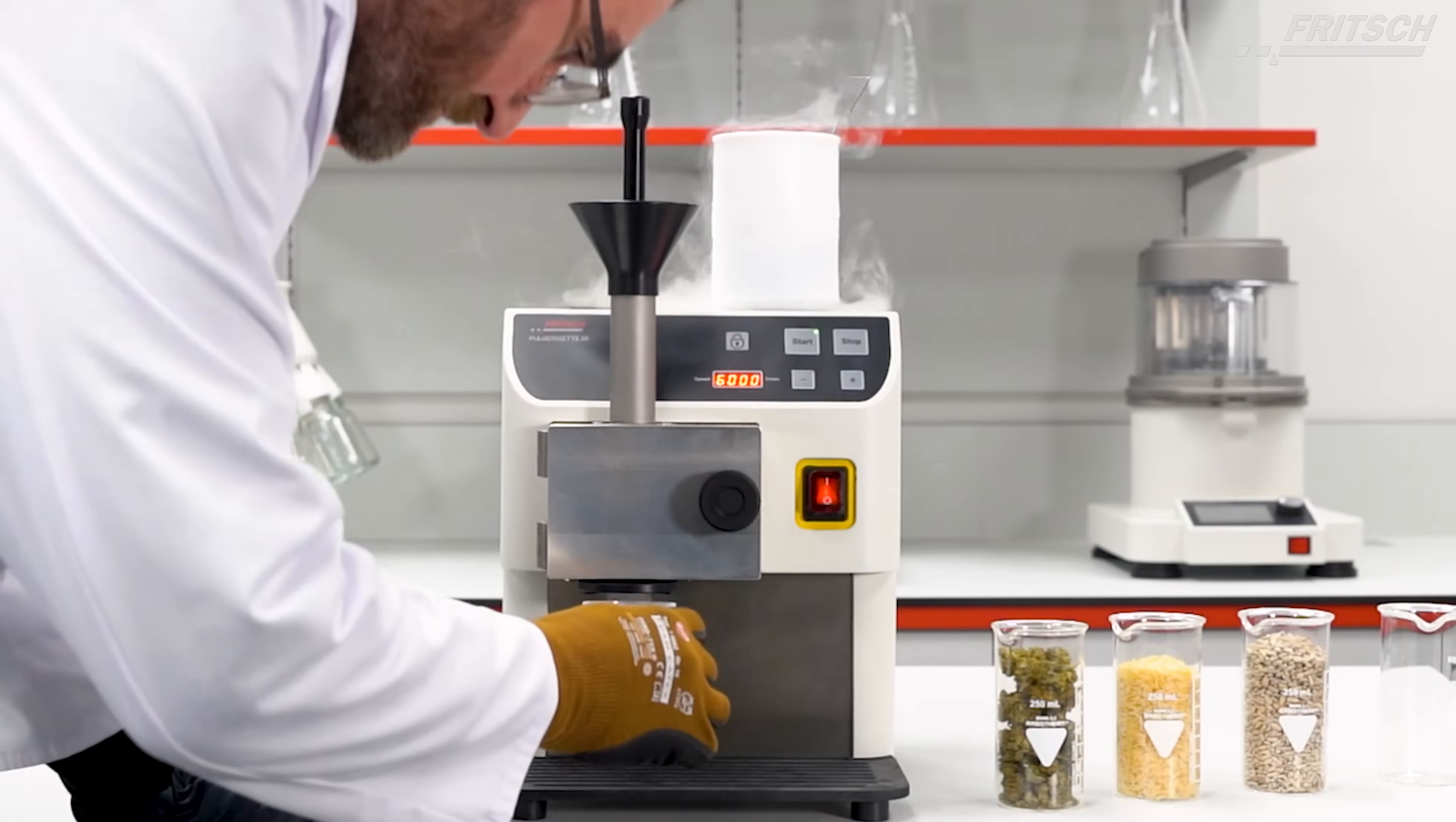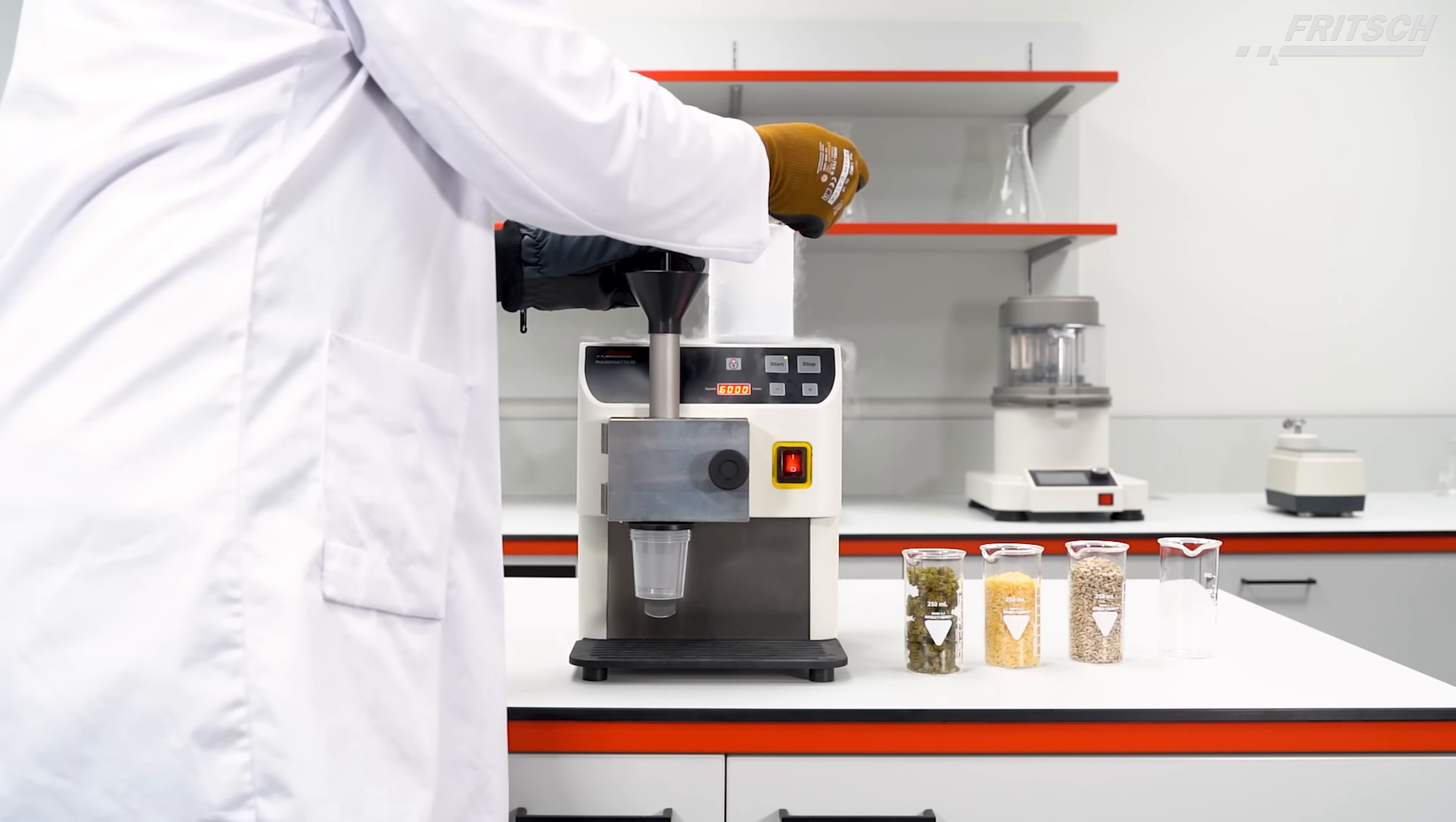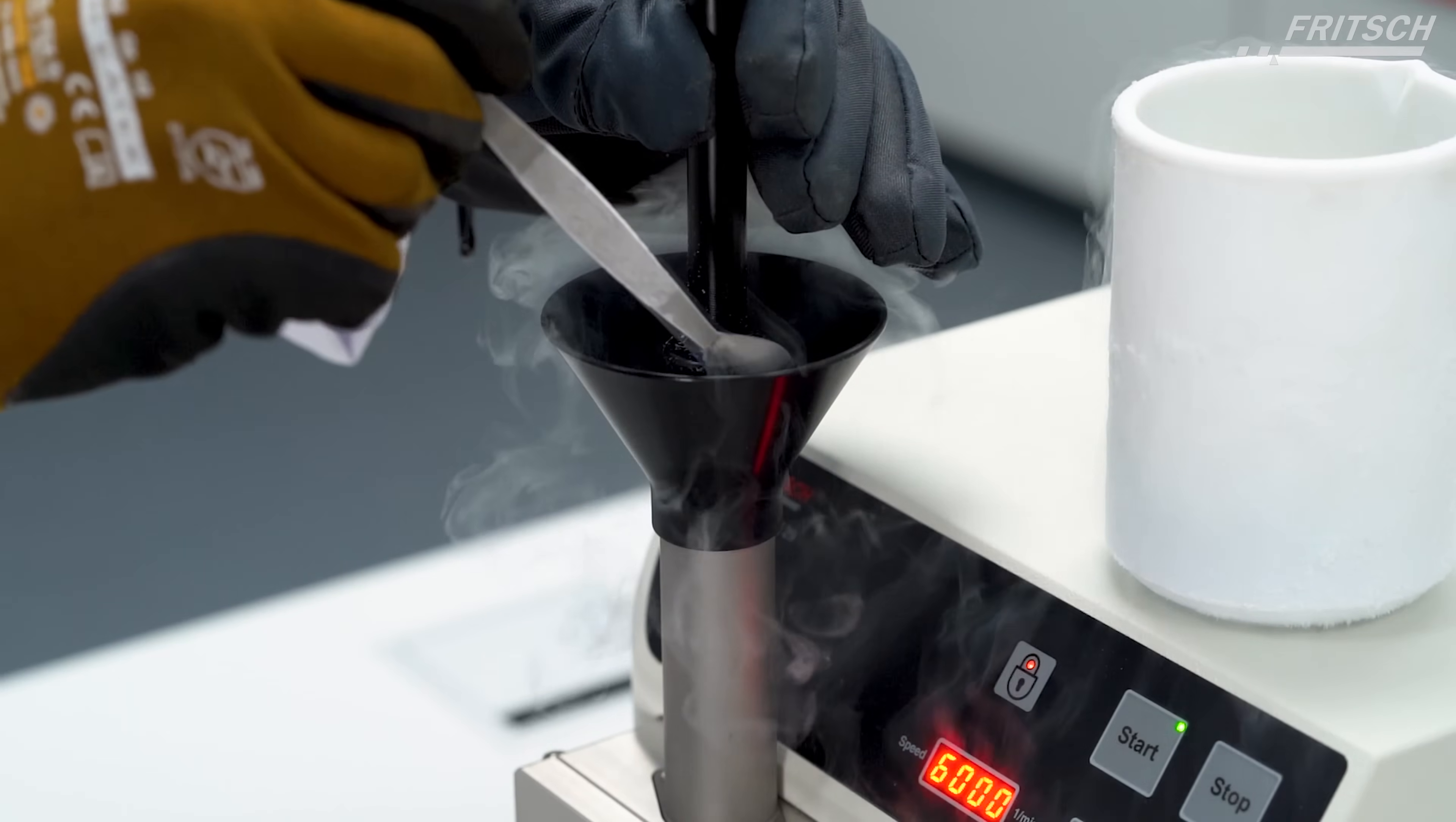Put the sample cup into the mount and the P29 is ready to mill. Carefully pour your sample into the funnel little by little and push it down slowly.